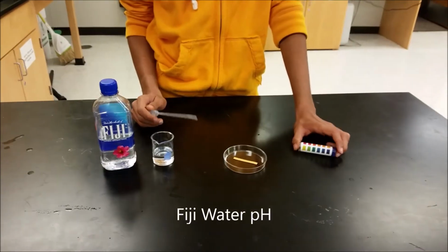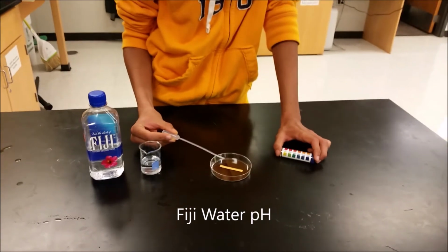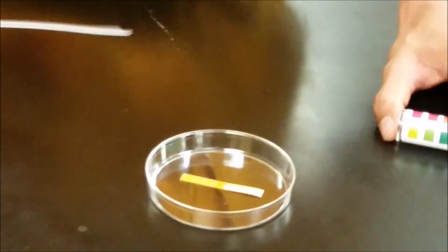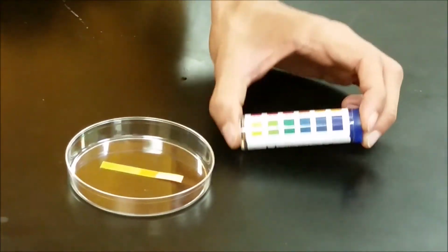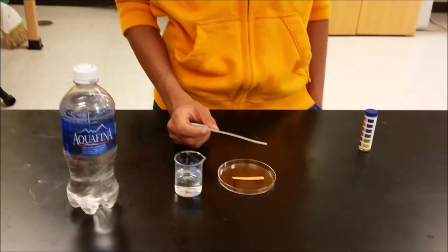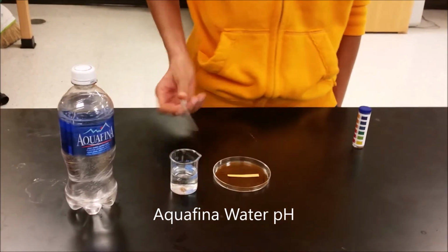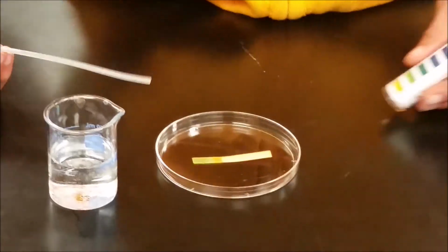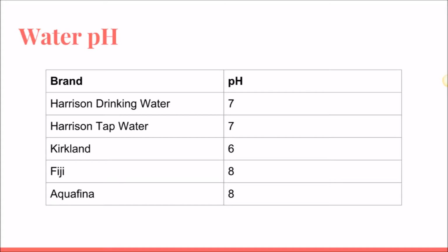Okay, now we have Fiji water, and we're going to test it again with the pH paper. Okay, so it's turning slightly green, meaning it's at a pH of 8. Okay, now we have Aquafina bottled water. We're again going to test it with the pH paper. And it's green again, so it should have a pH of around 8.